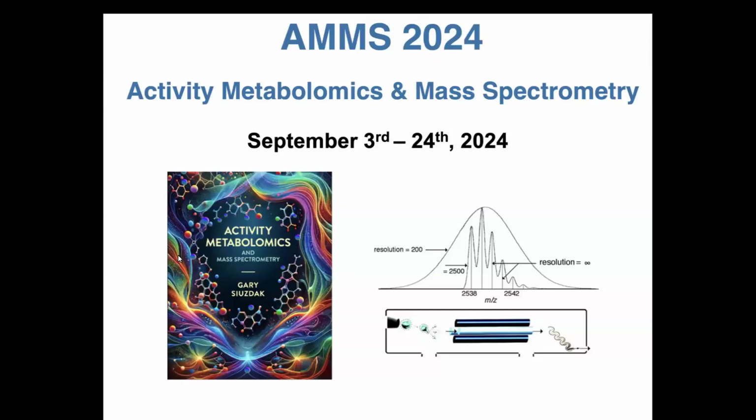I mean, clearly genomics, transcriptomics, proteomics, you can easily put those fields into digital biology. They're being applied and routinely being used to expand upon the field of digital biology. However, metabolomics still suffers from the aspect of not being able to get solid identifications on these molecules.